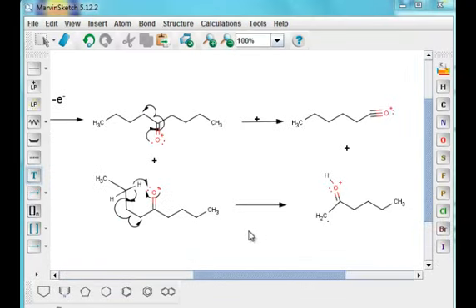Okay, well, rather than making you watch me struggle through this, I did go on to come up with the other ion. This would be the ion at 100, and this is the McLafferty rearrangement that's also on that University of Colorado website. I moved the atoms around, I did some rotating of the structure and so forth.